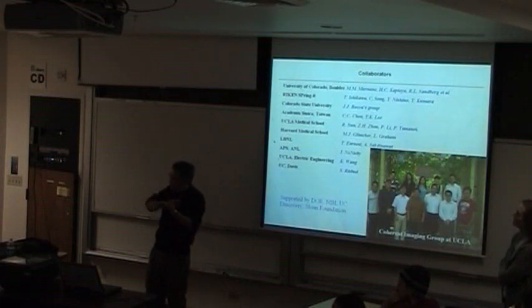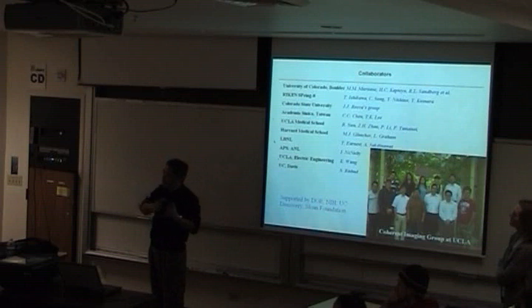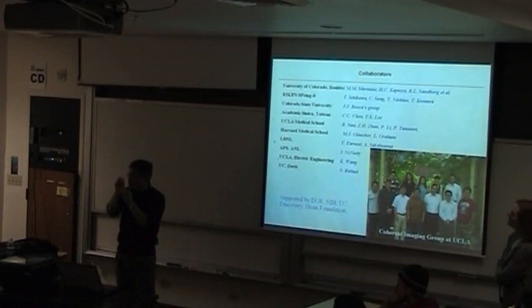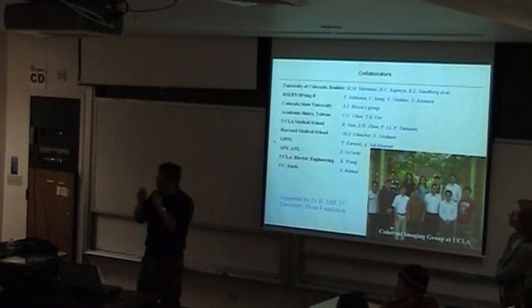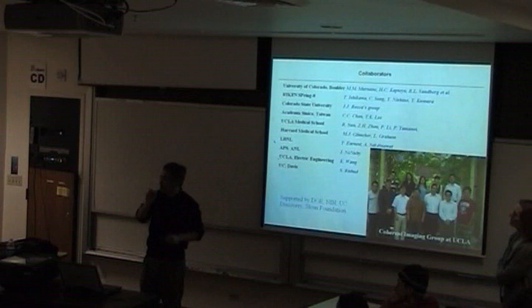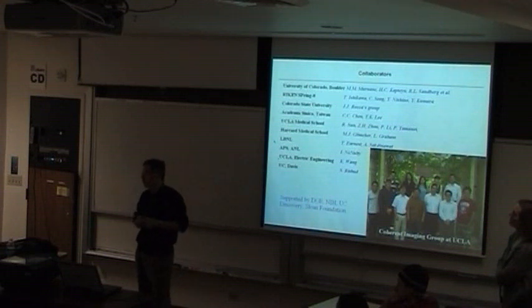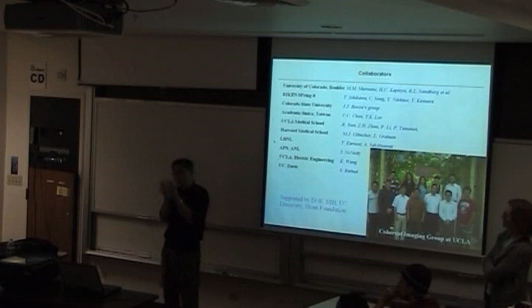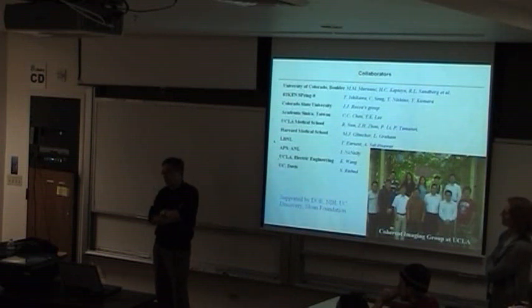So we sometimes do independent reconstructions and average them, which means the solution is not at one point because it could be near that point. There could be convergence to a few different points, but they're very close to each other when there's noise. So we usually do many independent reconstructions and then average. In comparison, they look very close. But in either case, with noise, you have convergence.